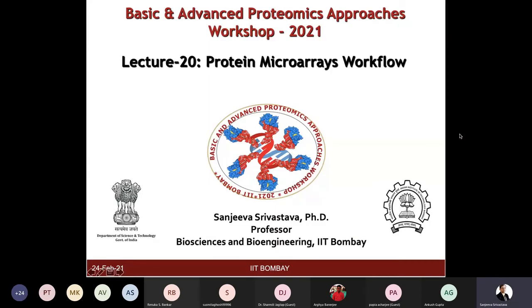All right, everyone. In this session, primarily, we will try to have more time where you can see some demonstration by Dr. Arup to show you how to analyze your data and make the networks from that. But before we come to the hands-on part, I'd like to continue where I stopped in the previous lecture on protein microarrays, and give you some idea of the workflow involved in doing this type of protein array-based work. And then we will come to the data analysis part.